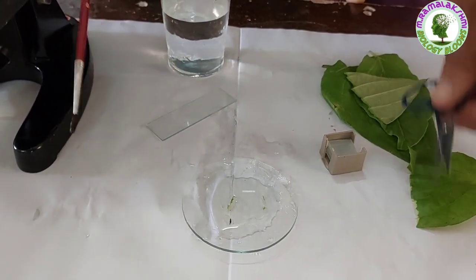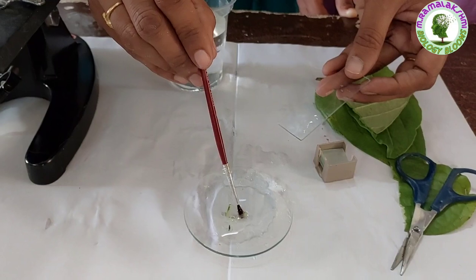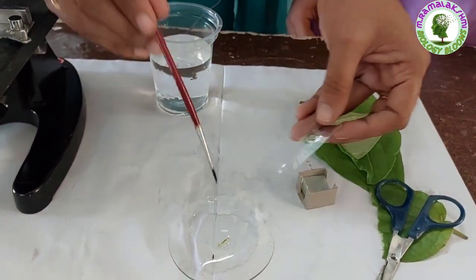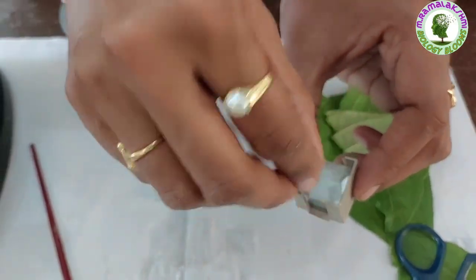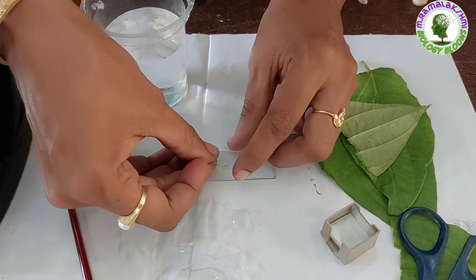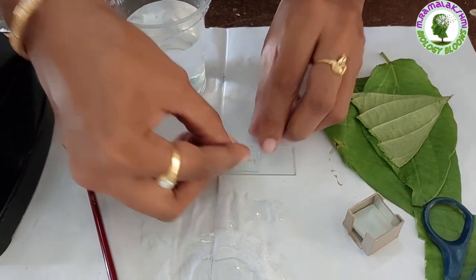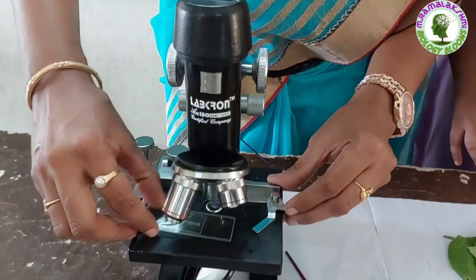Now take the slide and put the leaf peel on it, and put a drop of water on it. Now cover it with a cover slip without having any air bubbles. Now place the slide under the microscope.